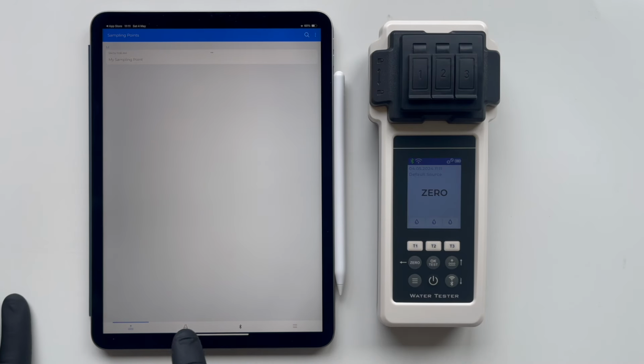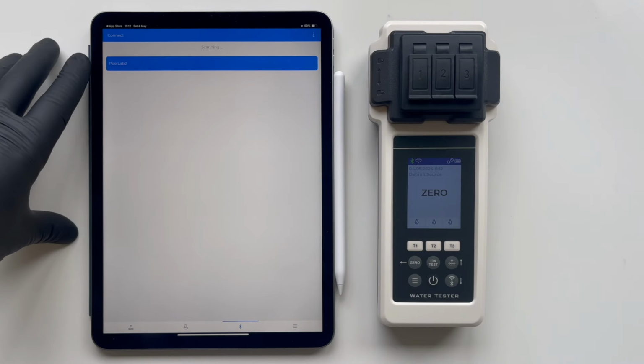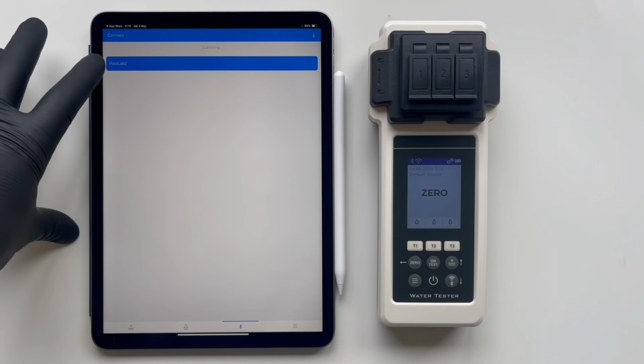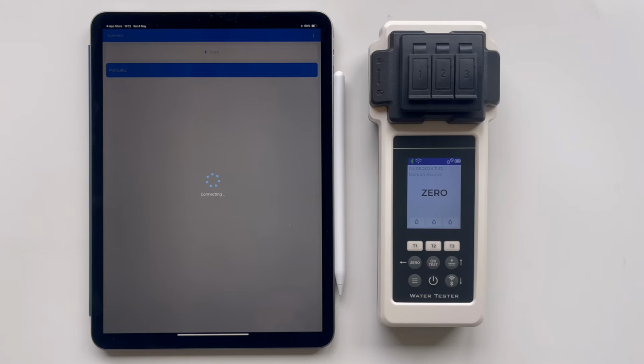We press the Bluetooth button, and the app finds the PoolWaterLAB. Here, it may be labeled as PoolLab or Water Tester. After the second connection, it will always be labeled as Water Tester. We select Water Tester. At this moment, when the tester is connected, it prompts us to update the device firmware.